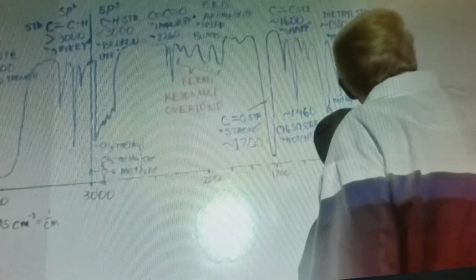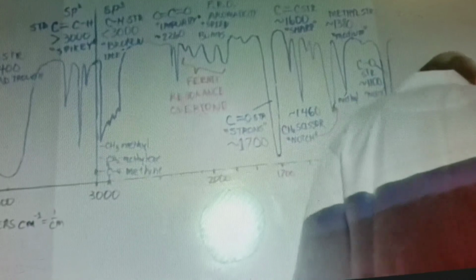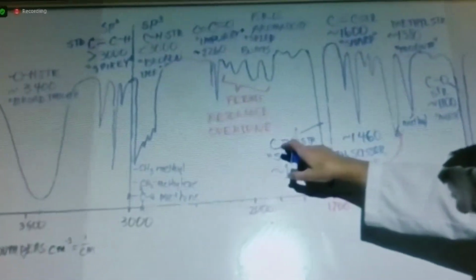Now here's the weird part. You guys that always doubted resonance. Sometimes you see a little C single bond O stretch from the resonance form of the carbonyl. I swear, I've seen hundreds of them.